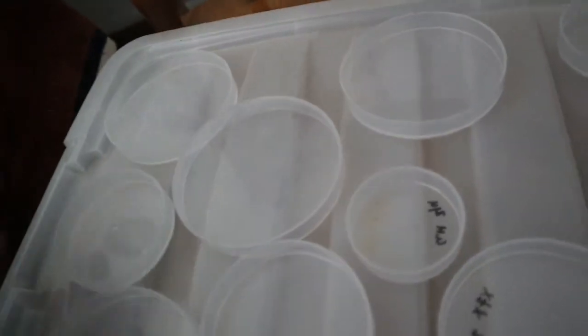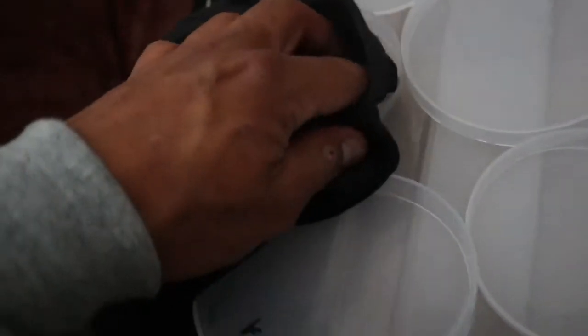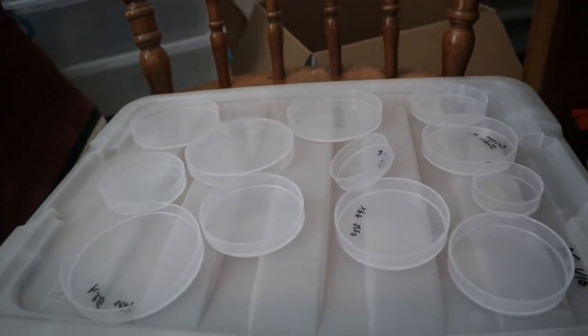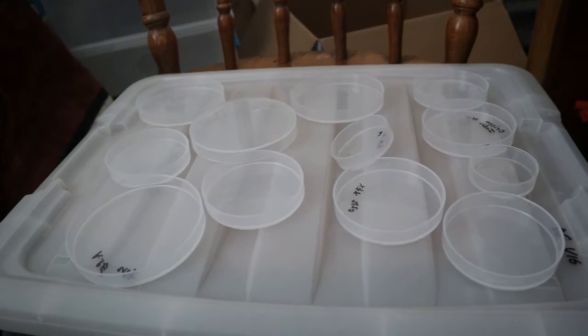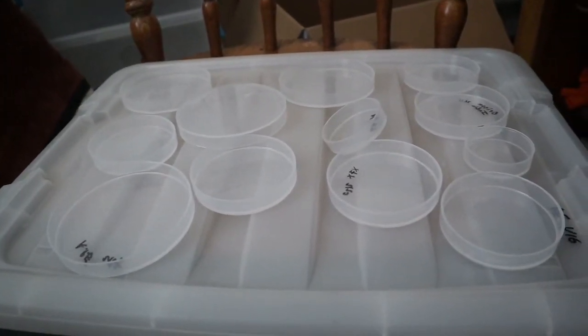There you go. So basically you want to get all your jars and then wipe them down with alcohol or clean them off. And then from there, we'll just get some tin foil and we'll wrap them up, throw them in the pressure cooker, sterilize them with your agar, your grains, whatever it may be that you're pressure sterilizing.